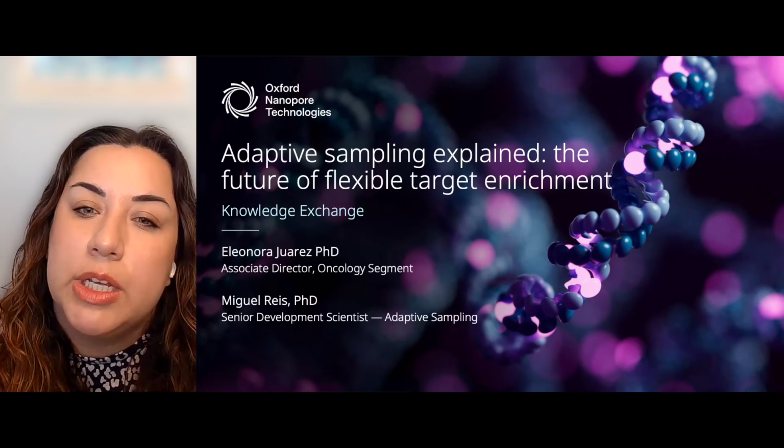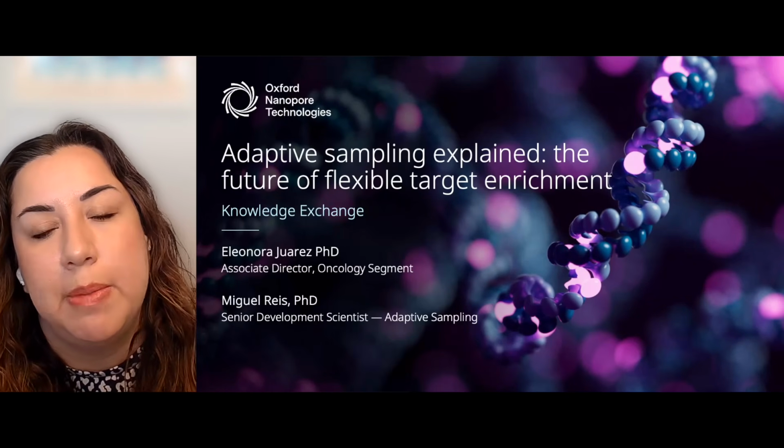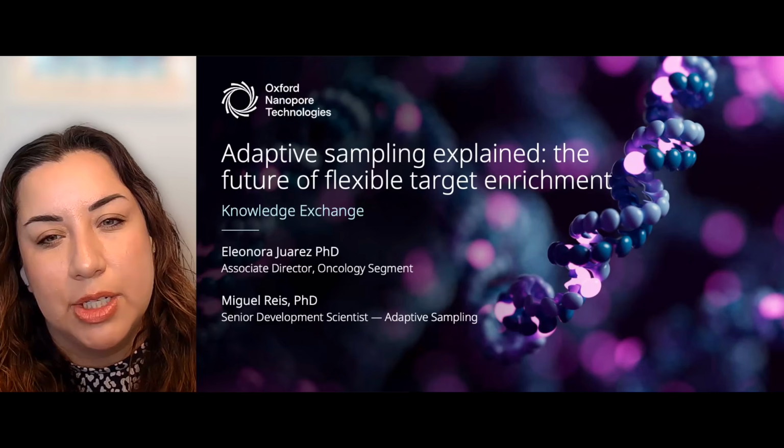And I'm excited to welcome you all today to this online session where we'll be looking at adaptive sampling, which is a unique software-based target enrichment method from Oxford Nanopore Technologies.